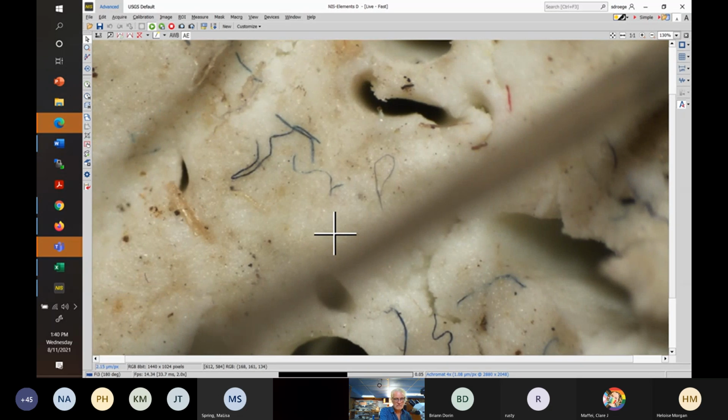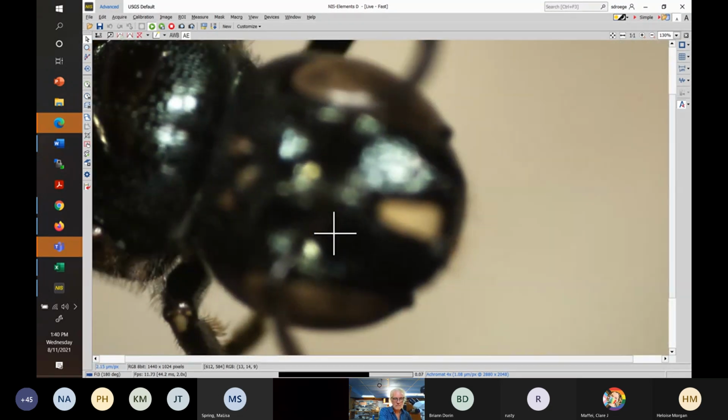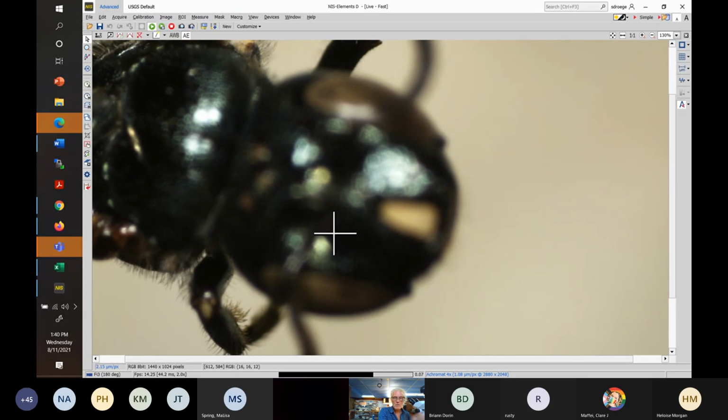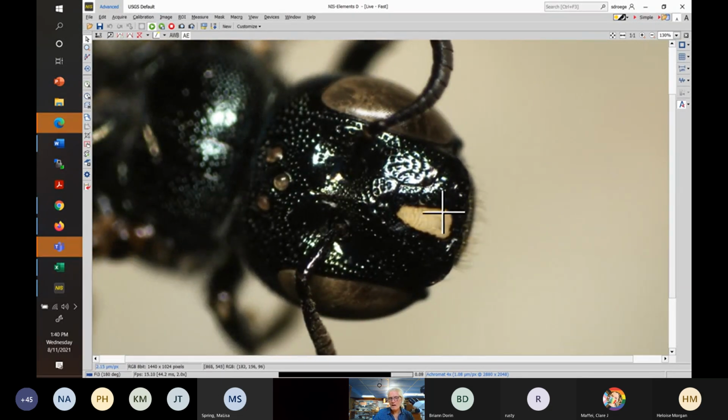What am I looking at? Filth. There we go. Okay, here's a more classic female head shape, roughly rectangular, larger in presentation. Rarely does it erode like it does almost always in calcarata. Not a given, but this would lean you towards Micmaci.